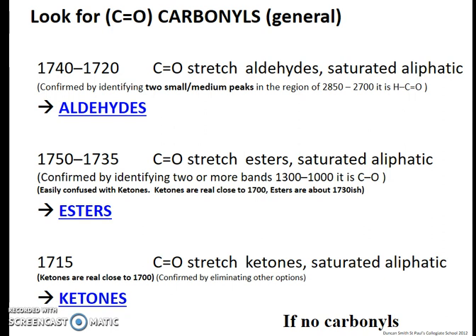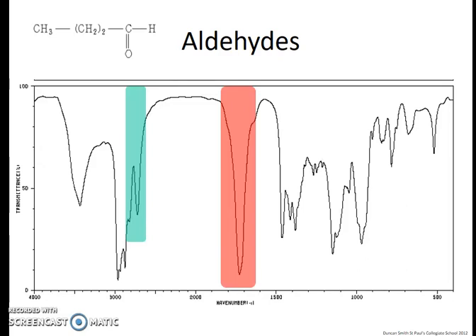The next thing is your carbonyl groups, which you will see generally between 1700 and 1800 wave numbers. There are different ranges for different types of molecules that have carbonyl groups in them, but quite often the spectra that you'll see are not specific enough in terms of their scale to be able to identify these directly. However, you tend to see these very strong, not particularly broad peaks.